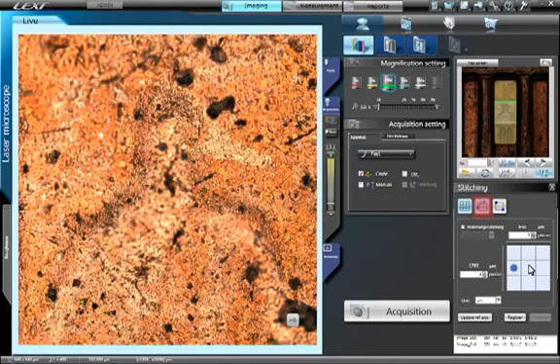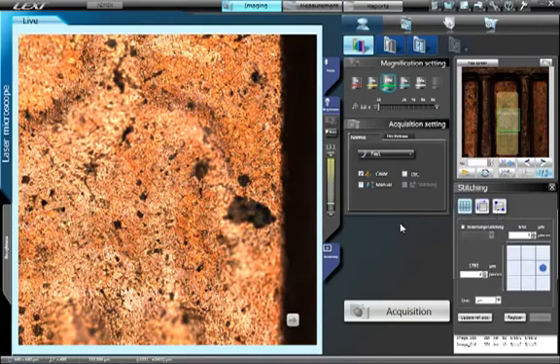Pressing the middle button allows you to define the acquisition area by length as opposed to image sections. The button on the right allows you to interactively define the top left and bottom right corners of the acquisition area simply by moving the joystick. If at any time you have moved the joystick, press the Update Reference Position button to realign the reference position to the acquisition area.